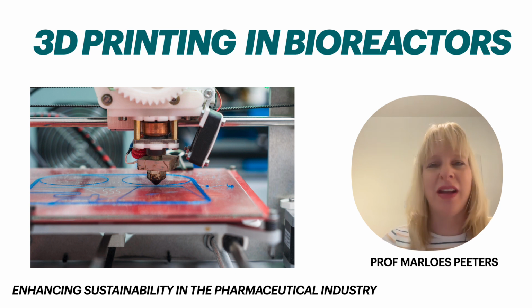The question I've been getting then is, why don't we use 3D printing for bioreactors, or how often is it actually used in the pharmaceutical industry and what are its drawbacks? And this is exactly what I'm going to discuss in this video.